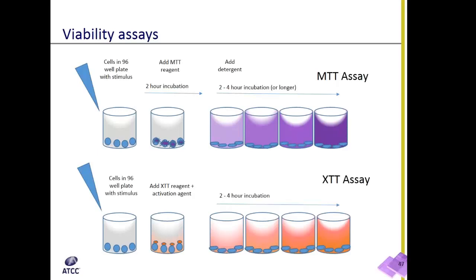At this point, there could be an incubation period for a few hours for the reaction to complete. After this process, during the incubation period, again, you see the change in media, and the better the cells are growing, the more apparent the change in the color of the purple media is going to be. With the XTT reaction, the XTT reagent and activation agent are added in one step, and the reaction starts almost immediately. So the real benefit of the XTT kit is this one less step in the protocol, which will knock off a couple of hours in the reaction. So with the XTT kit, as soon as it's applied, there's an incubation period of a few hours for the full reaction to take place.